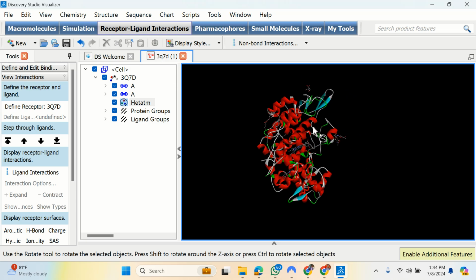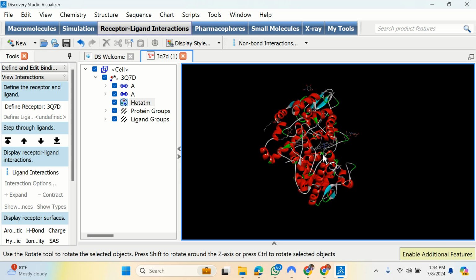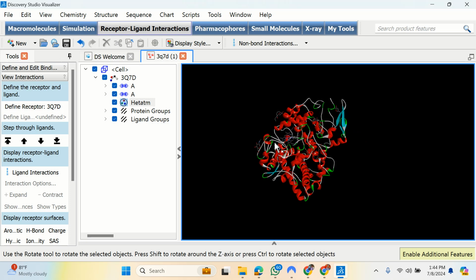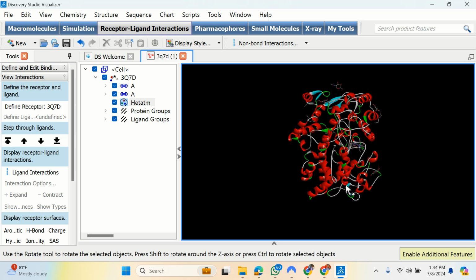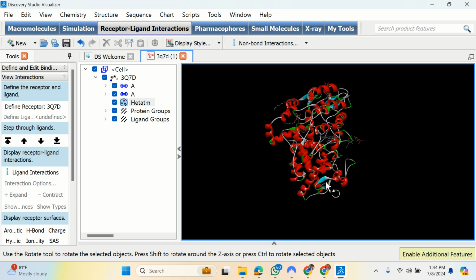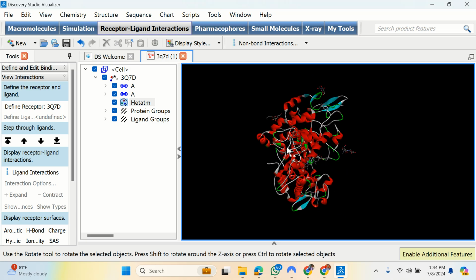Something like this one is inside the protein. You see this one is inside, that will tell you that it's not like magic I'm showing you. That one is inside. Then another one that is inside again is this one. This one here is inside as well. Then how did I know that these two are inside?